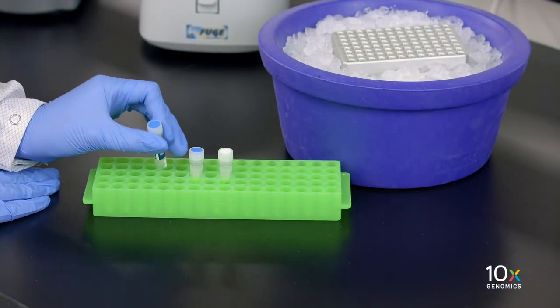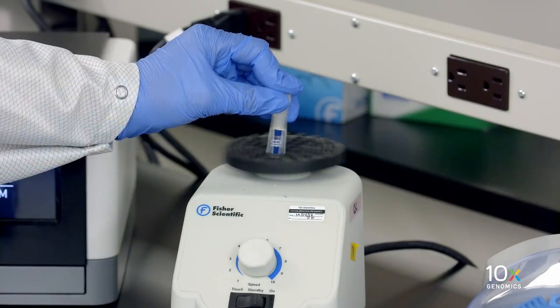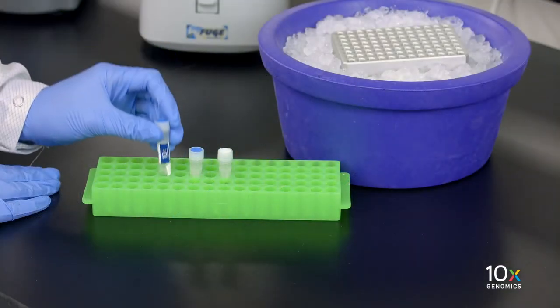First we have our RT Reagent B. Equilibrate to room temperature, vortex, verify there is no precipitate, briefly spin down, and leave at room temperature.